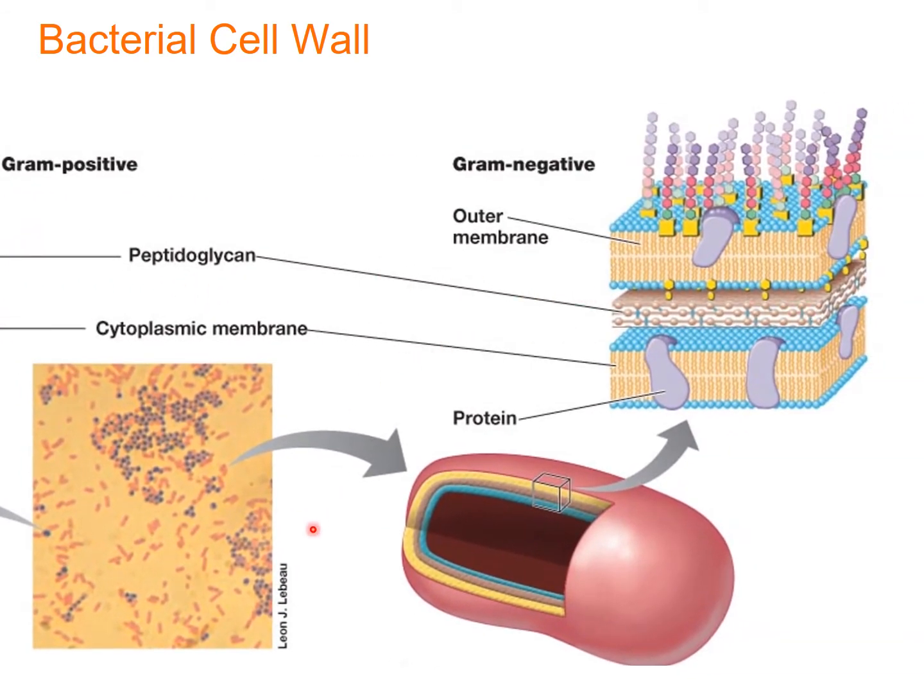And when we look at a gram stain that has mixed species, we can see that the gram-negatives with their thin peptidoglycan cell wall stain pink, and the gram-positives, which are represented by the Staphylococcus here, stain purple, like we saw on the slide immediately prior.